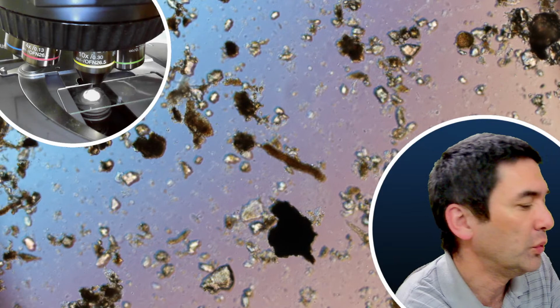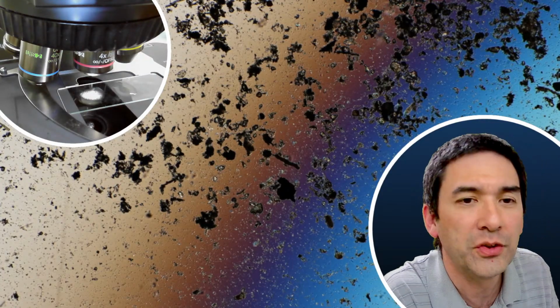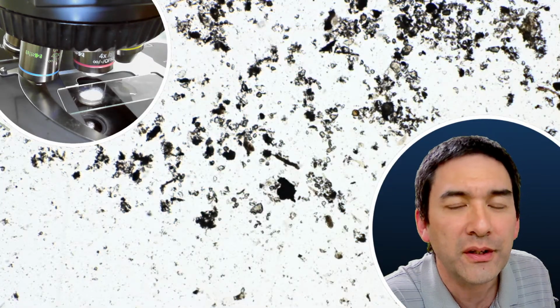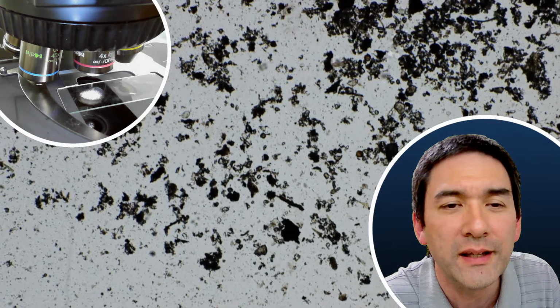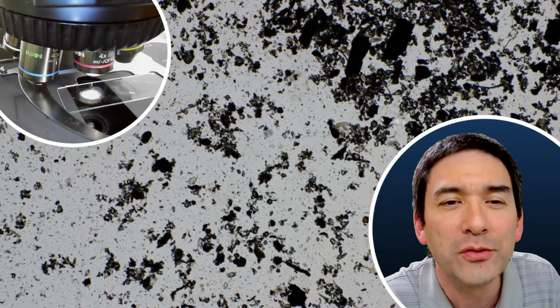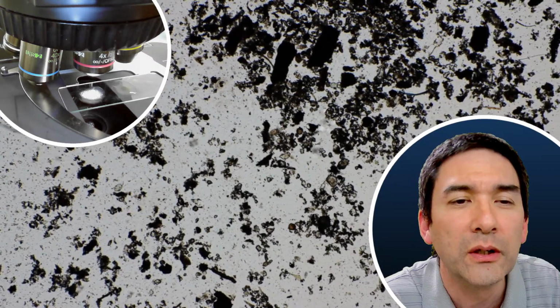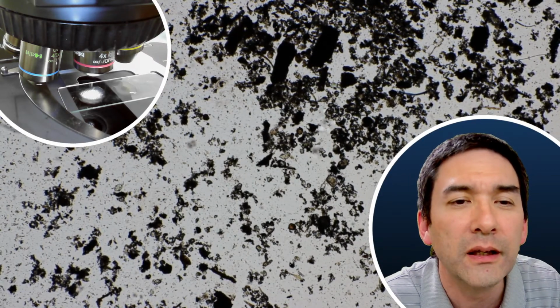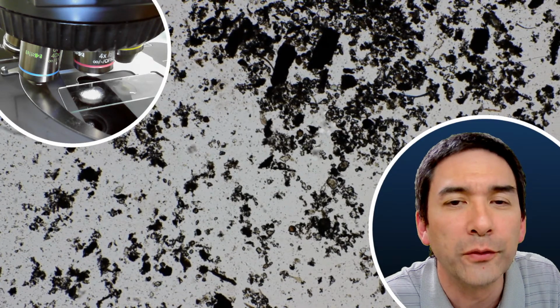So maybe I'm going to go down with the magnification again. But I have to be honest with you, I do not want to simply spend the next hour or so just looking for tardigrades, and then it's also not going to be very interesting for you. But usually a good approach is to look for a little bit of movement, okay? Like there's some movement over here, but this looks a little bit more like a rotifer.